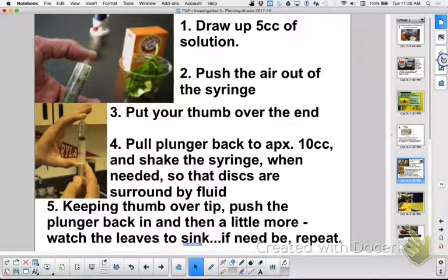Okay. So now I would take this one and my other one, and I would put it here, time 0, start my time, okay? Now, when you take your first measurement, do not stop the clock. Time moves forward, okay? Just take your reading at 2 minutes while the clock's still running, and then take your reading at 4 minutes. And if you're going to count them, probably the one without CO2 isn't going to float. I'd be really interested if it is.